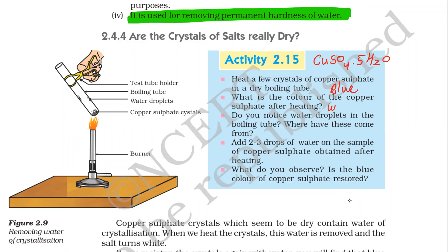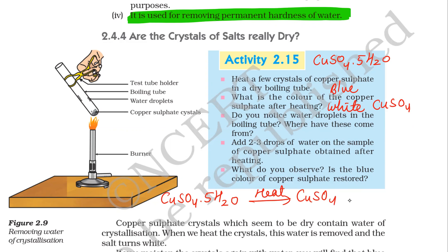After heating, it becomes white because it becomes CuSO₄ only. Do you notice water droplets in the boiling tube? When we heat CuSO₄·5H₂O, it forms CuSO₄ and 5H₂O. These water droplets are separated. Yes, water droplets are noticed in the boiling tube.